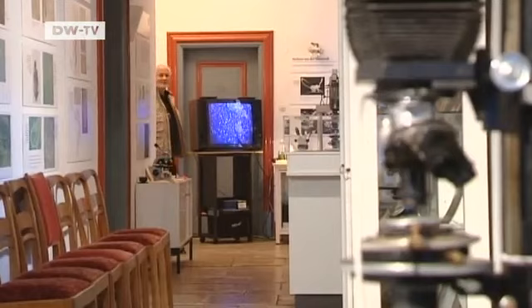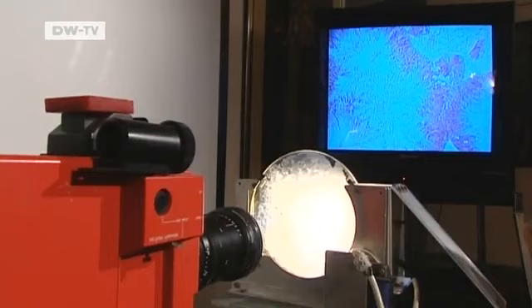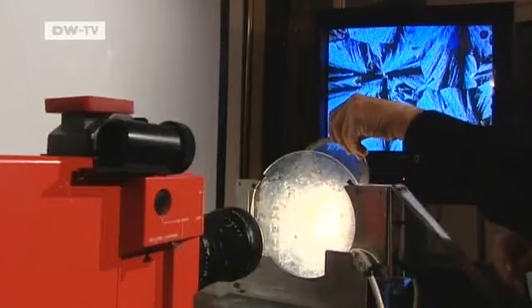His passion for microphotography has led him to chart ever new territory. A pioneer in his field, he used a special filter to add color to his black and white shots. His invention was revolutionary. The structures of most crystals are colorless, but adding a filter lends them contrast. A second filter, the polychromator, fragments and disperses the light. Parts of the spectrum are isolated to create color.